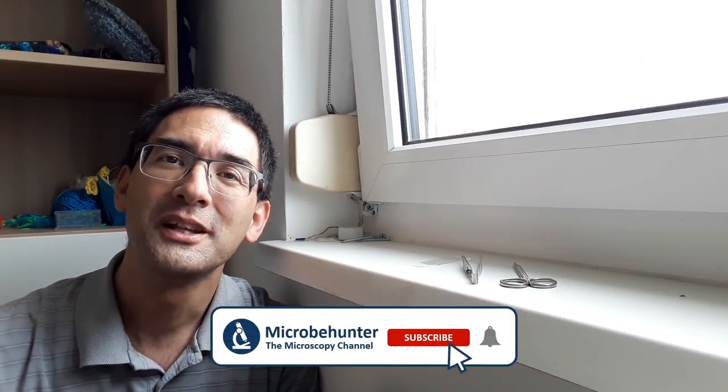Hello Microbe Hunters! Oliver is here. You can see there's quite a bit of dust and dirt in the corner over there, and also a small spider's web all covered in dust. What I want to do today is figure out the thickness of one thread of spider silk, and of course I'm going to be using my microscope to find it out.